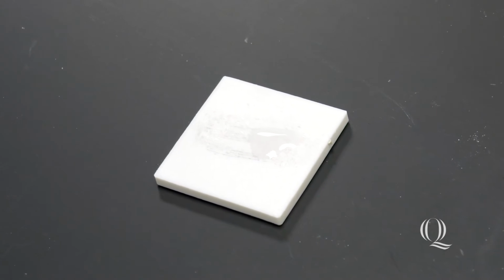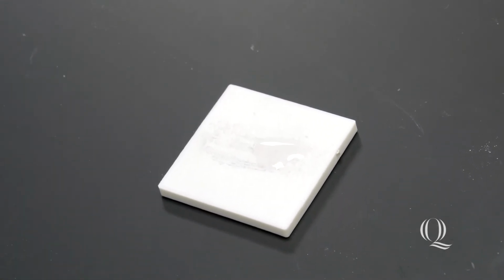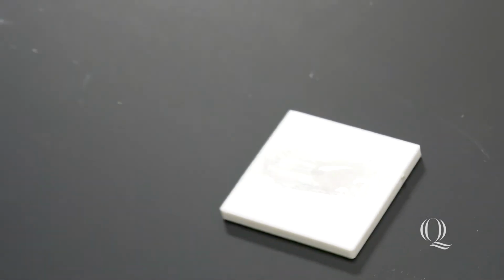Now you can see it reacts, because I've broken up the mineral, I've powdered it, and so now I've released that calcite, the calcium carbonate, and sort of broken out the magnesium, and now I can actually get it to effervesce. But it doesn't effervesce as strongly as the pure calcium carbonate. And that is just one of the other properties that these two minerals in particular have, that it reacts.